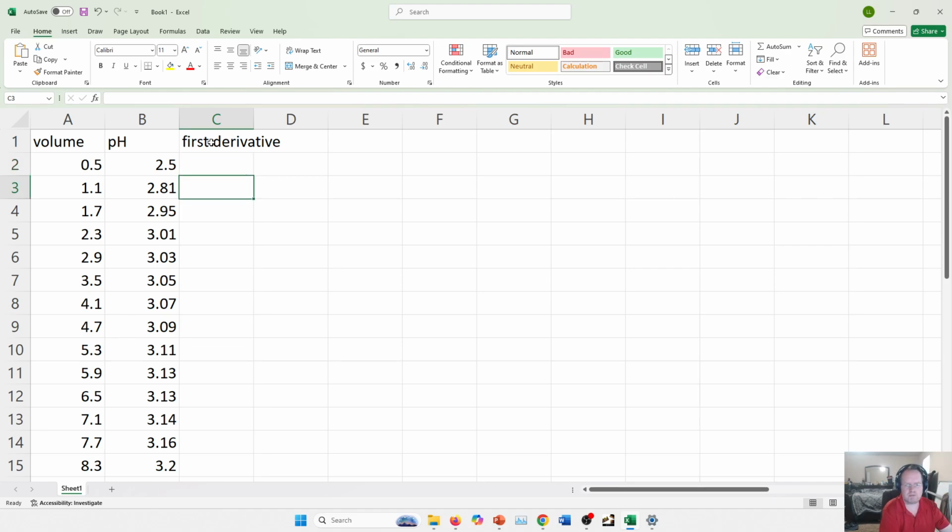Now I'm going to the second point, because the first one I can't subtract anything from because there's only one data point. So I make an equal sign. And I'm going to make sure to put this in parentheses. So I'm doing everything in the numerator first, everything in the denominator, and then I'm dividing them. If you don't put parentheses around things, it'll be dividing the wrong things by each other, right? Because it'll think you've got one number minus a fraction minus another number instead.